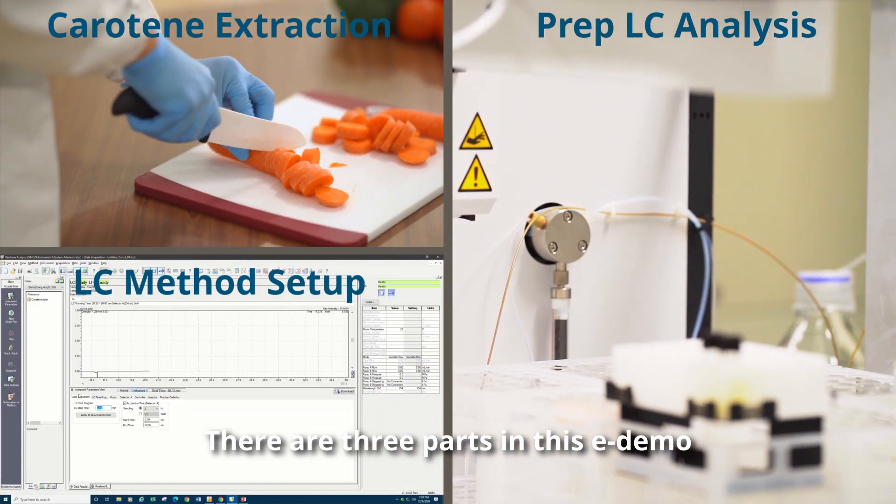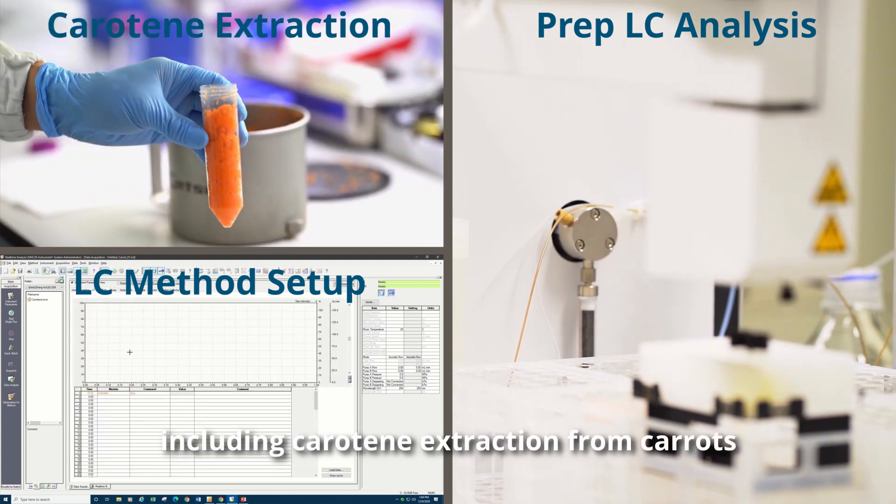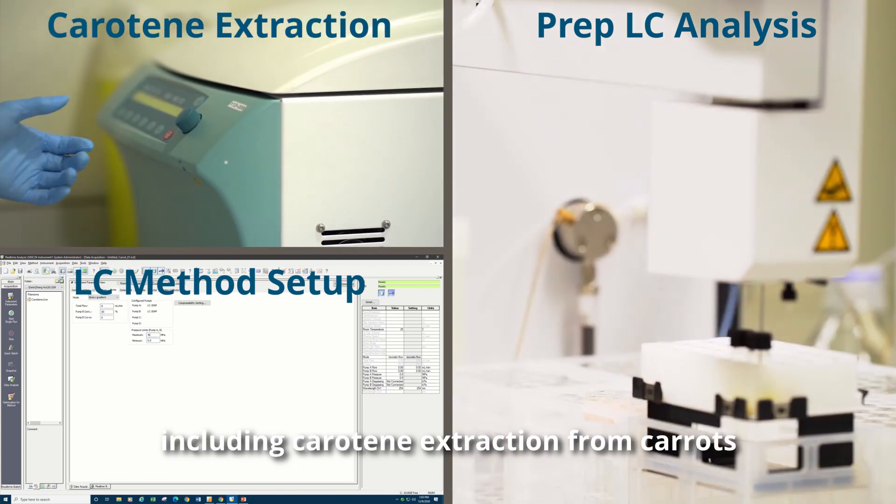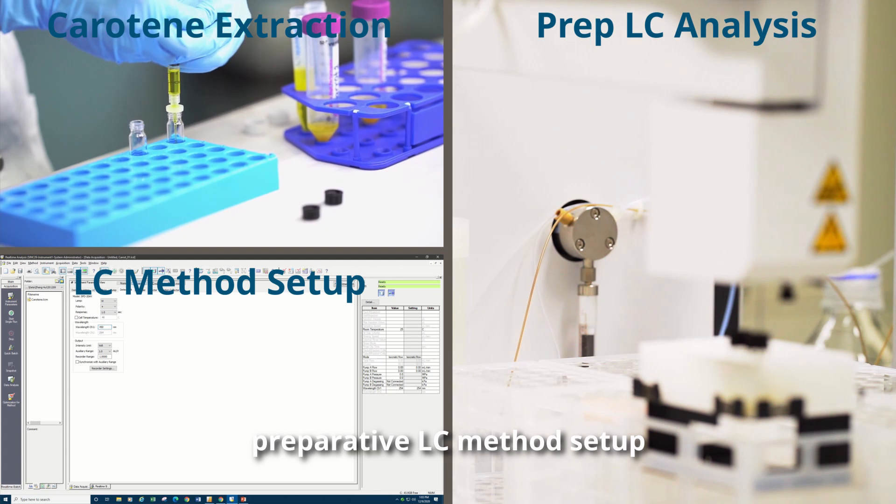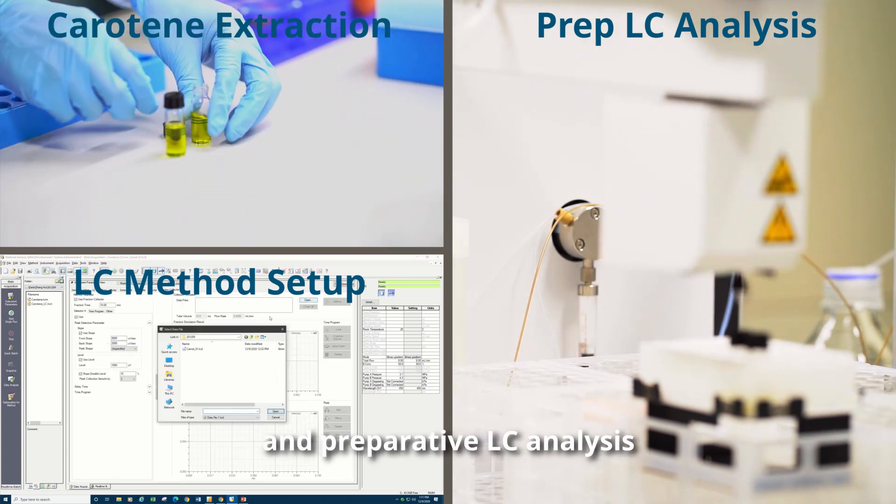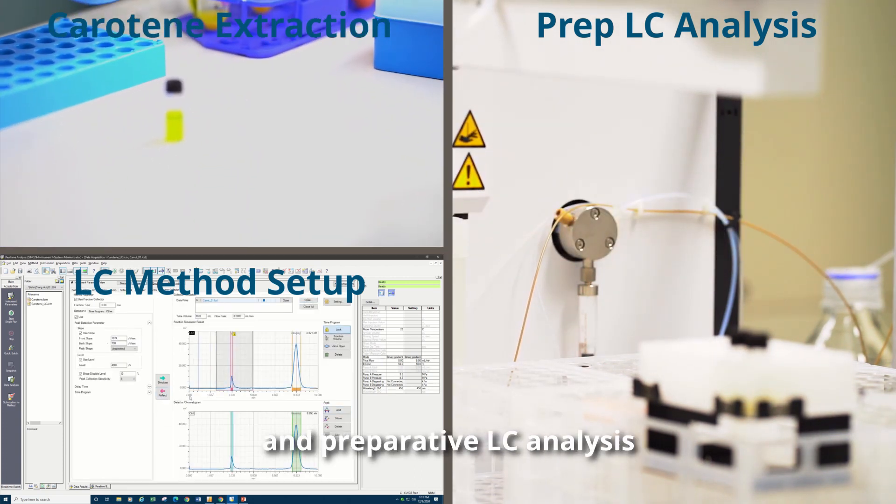There are three parts in this e-demo, including carotene extraction from carrots, Preparative LC Method Setup, and Preparative LC Analysis.